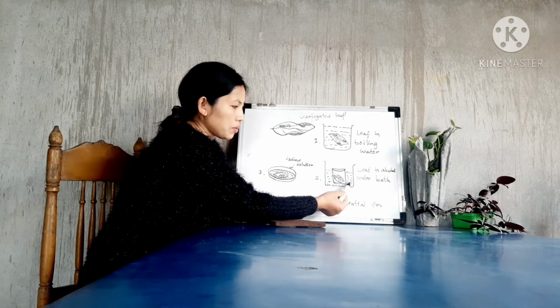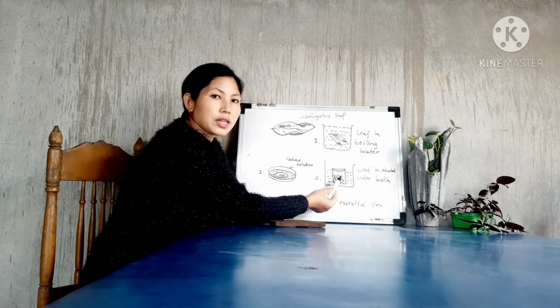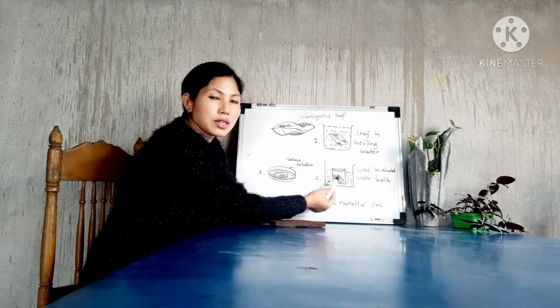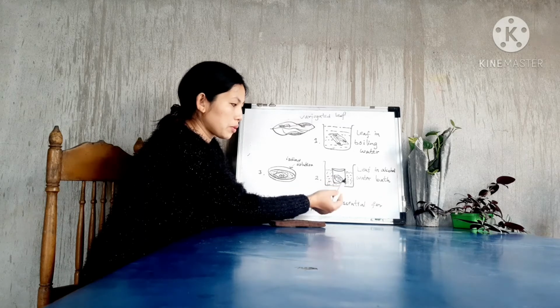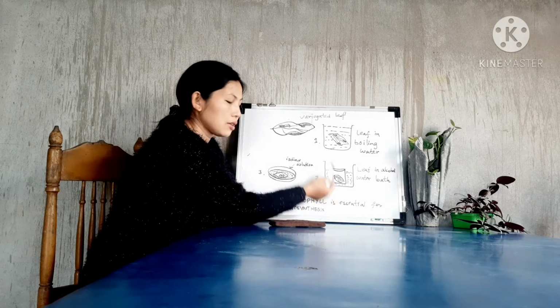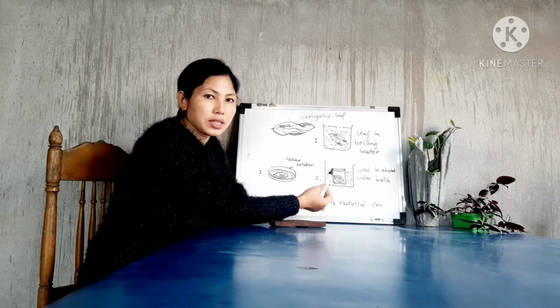With the boiling of this water, slowly the alcohol inside the beaker also will get boiled, and with this the leaf will start to get decolorized, meaning all the colors that are present in the leaf, including the chlorophyll, will vaporize, and we will boil it until the leaf gets decolorized completely and becomes white in color.